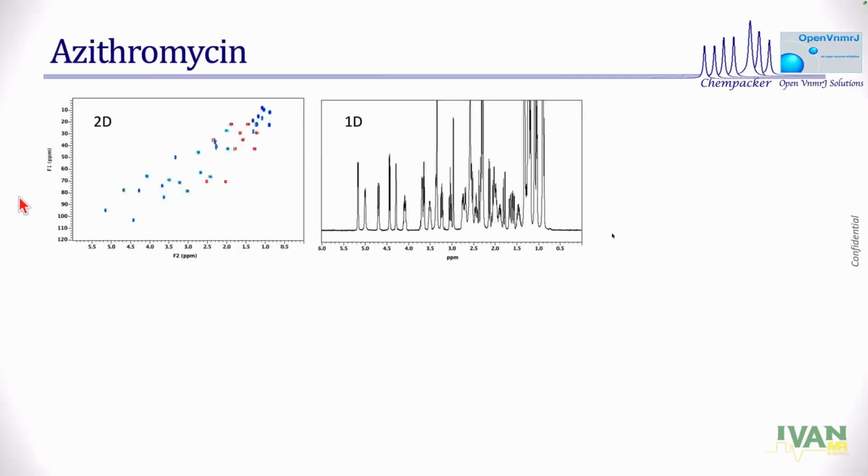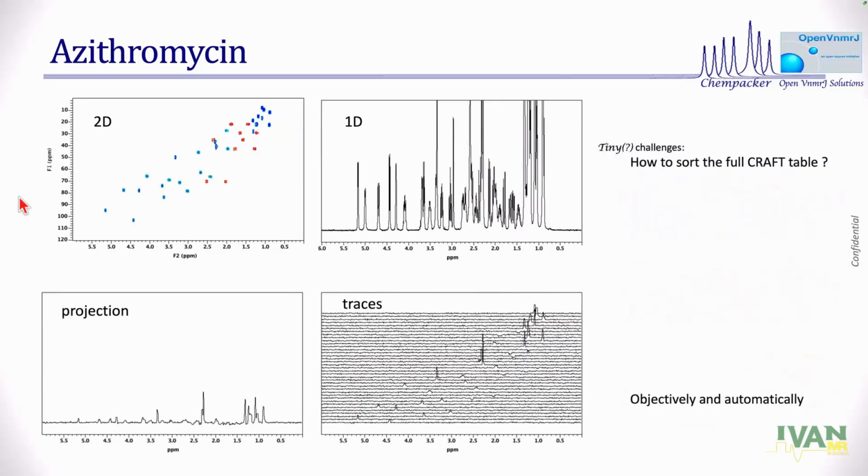That's a challenge. So let's take a look at the azithromycin 2D spectrum. What would I have to do with the 2D spectrum? I have this 1D, I have this 2D. If I have a carbon, I put the carbon on the vertical side and then I connect the dots. Alternatively, in the problem that I'm facing, I want to somehow make this proton spectrum homonuclear decouple itself, or I want a chemical shift spectrum. So I look at the projection. That is obviously not very useful for me.